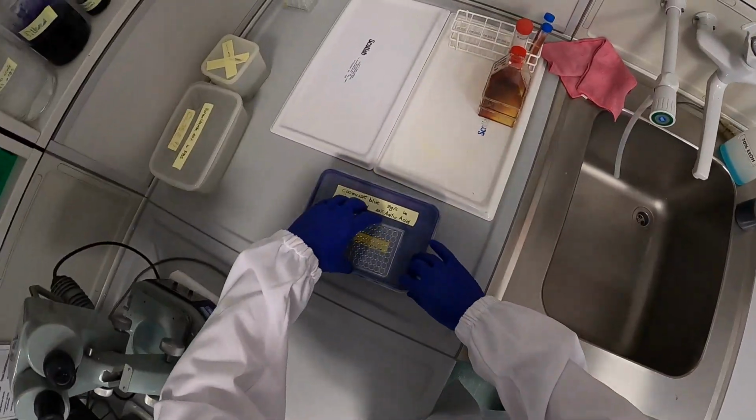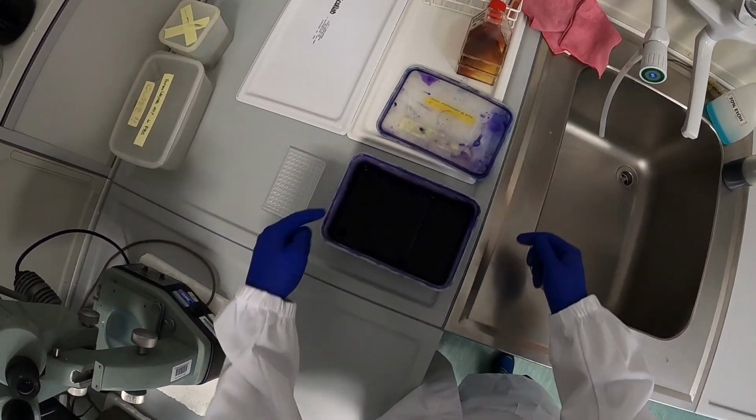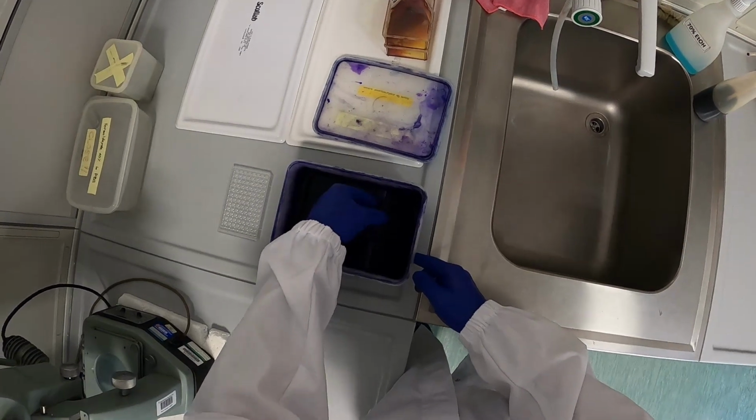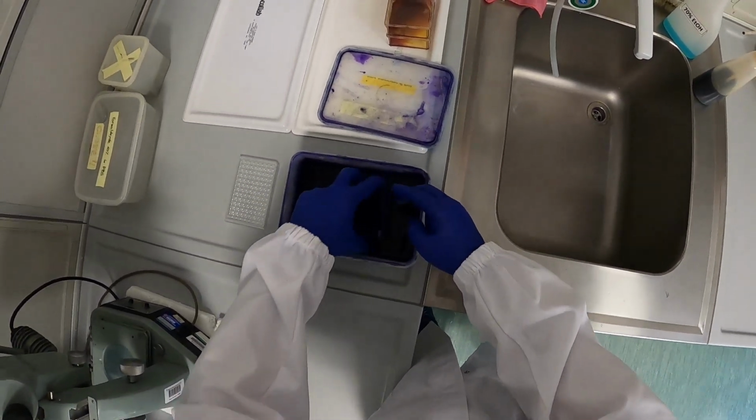Two hours later. Yeah, I have to apologize. I was not there when you fixed the cells for 1 hour and then placed the plate into the Coomassie blue for 1 hour. I had to be somewhere else, I'm sorry.